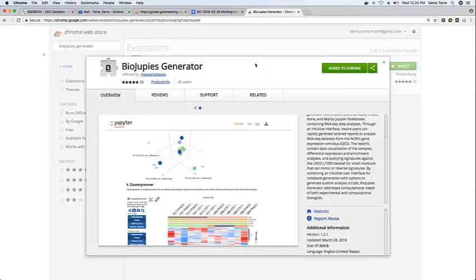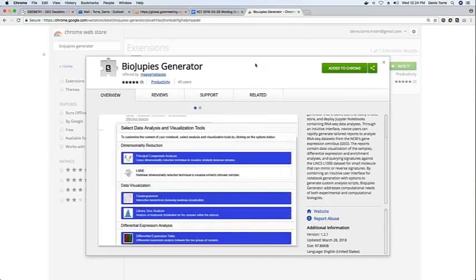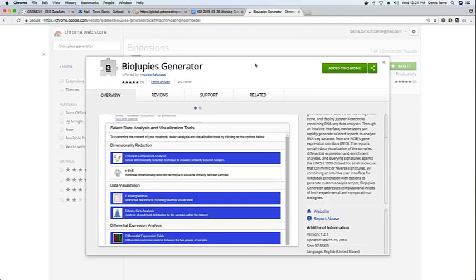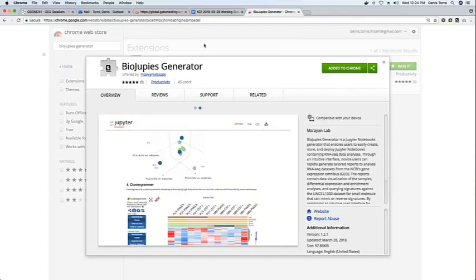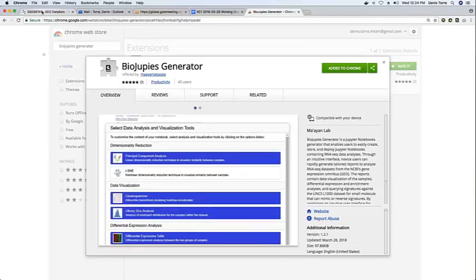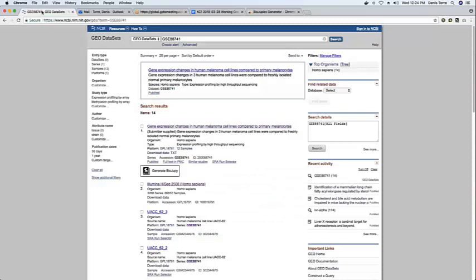And these embed functionalities within websites in order to improve user performance and to improve user experience. So this specific Chrome extension enhances the website of the gene expression omnibus.